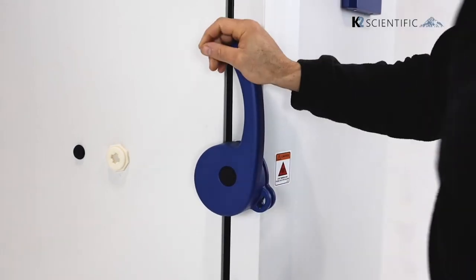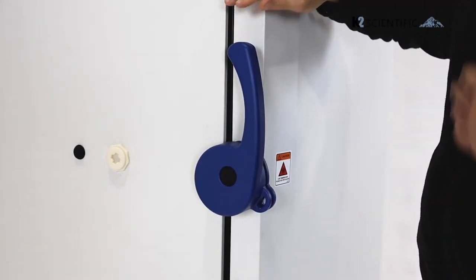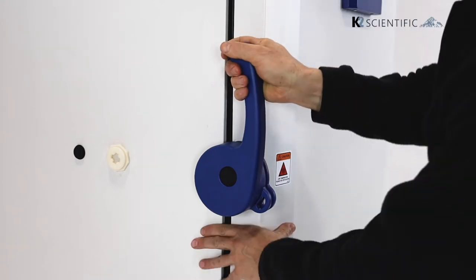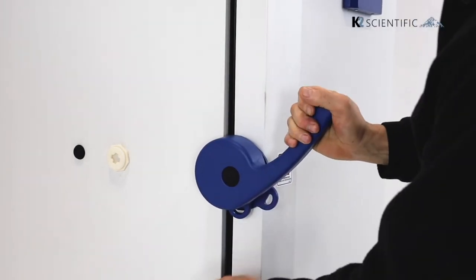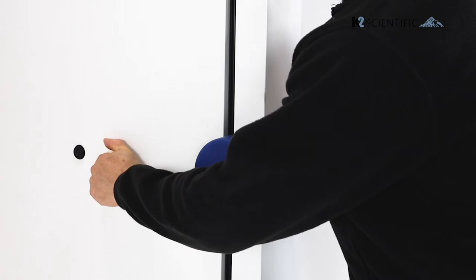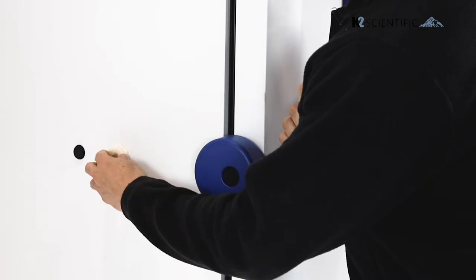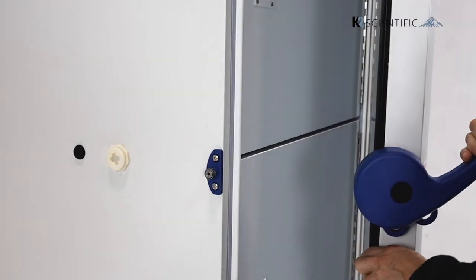Now occasionally, pressure will build up inside the unit that will make it very difficult to open the door. So what you can do is use this release valve on the side to release some of the pressure, then you can open the door.